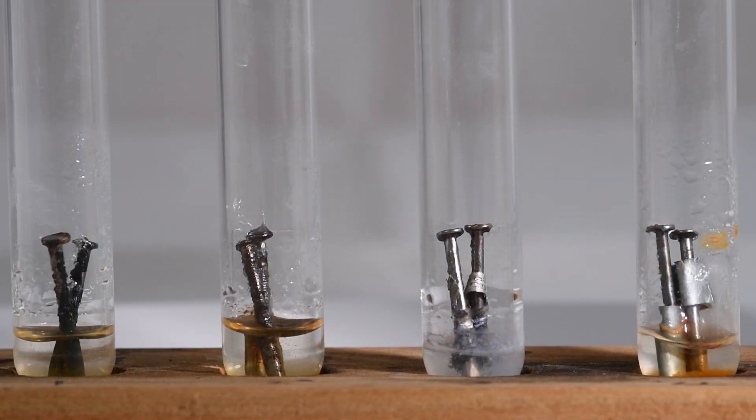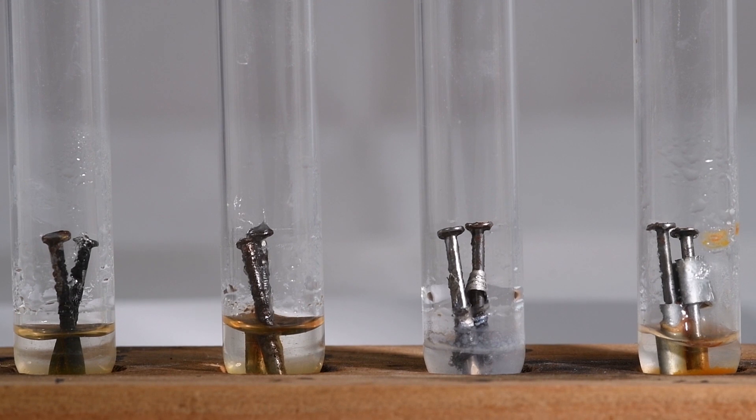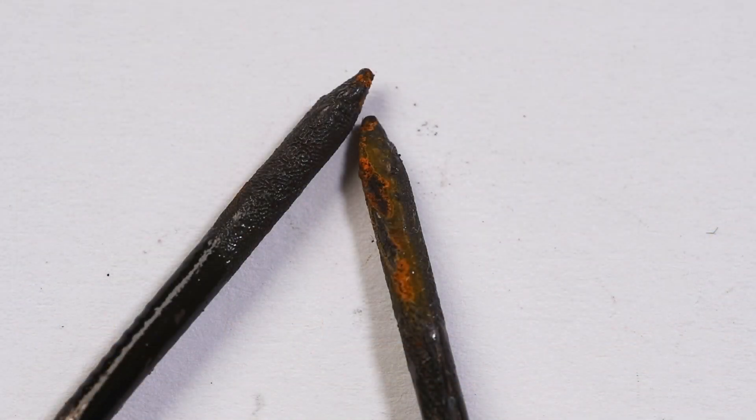These nails have been reacting for the last couple of weeks, so I'll get them out of the test tubes and have a look at them. Looking at the first prevention method — the anti-rusting paint — you can see that there's not a lot of rust. The paint has provided a good barrier protecting the iron from the water and the oxygen.